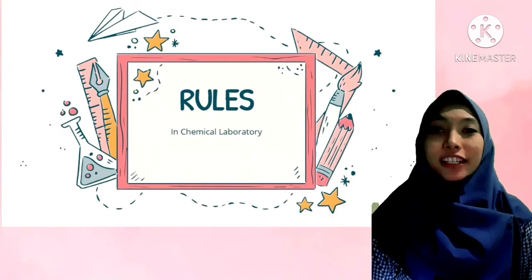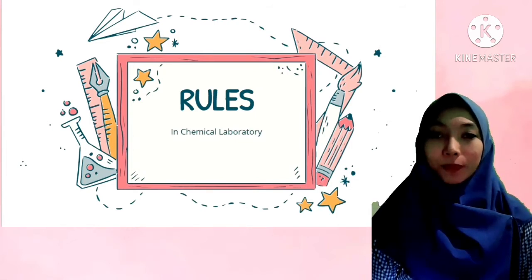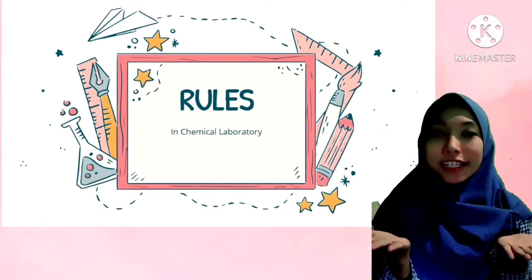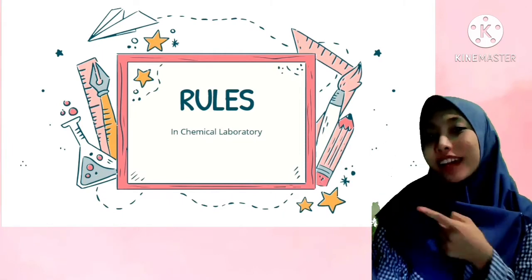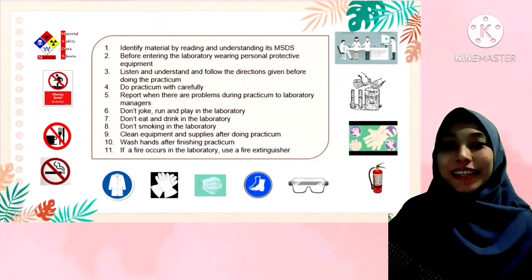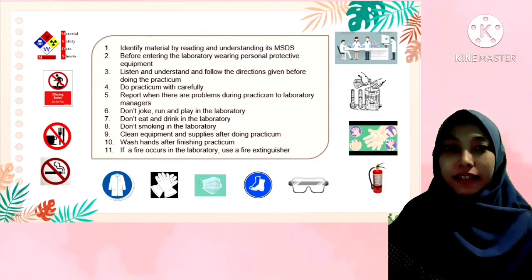After I discussed hazards earlier, I will now discuss the rules in the chemical laboratory. What rules should we obey and enforce when in the chemical laboratory? Let's look at the following explanation. Rules in the chemical laboratory: identify material by reading and understanding its MSDS.